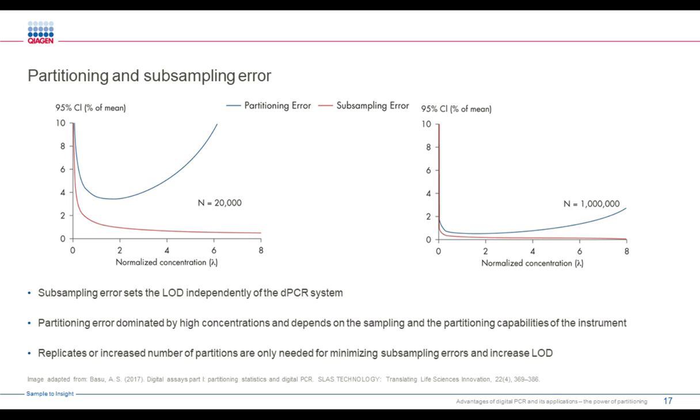So that is what's called subsampling. So to really be able to be sure to get that molecule from me into the tube, you need to take multiple samples from me to be able to actually get, let's say, 1 in 10,000 or 1 in a million, for instance, into the tube. So that is actually what subsampling is all about.